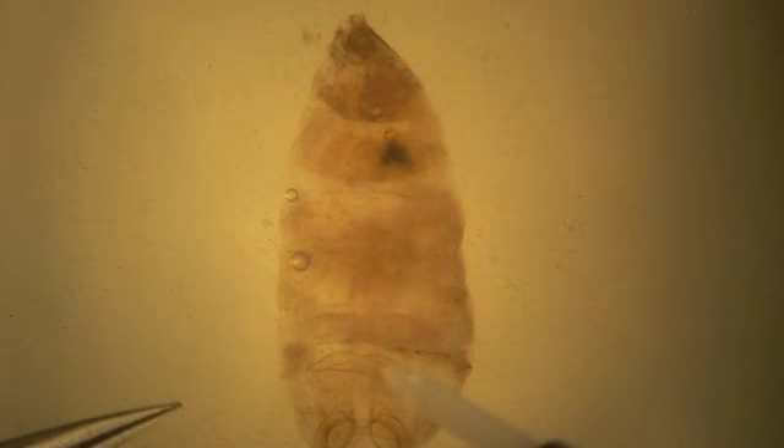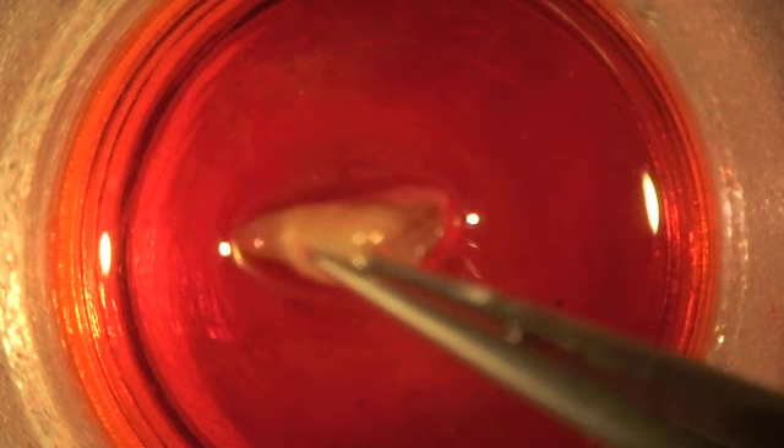After most of the scales are removed, the abdomen and genitalia are transferred to eosin stain, where they remain for three to four hours.